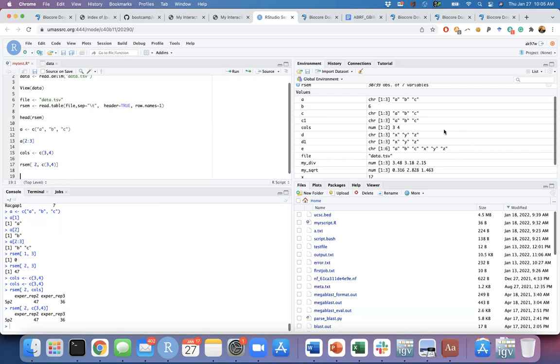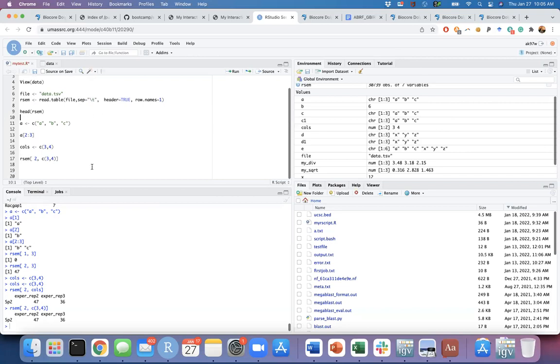It is the symbol for tab. Yeah. Okay. What does \t mean? It is an escape character. You remember when we were talking last week, in the last session, we were using it in grep, for example, or awk actually, we used this \t. It's a tab character to put the separation while you're creating your tables. And then when you open it, you need to use that tab \t here. Same thing. These are the same in many languages, like in Perl, like in R. In many languages, we use similar escape characters. In awk, it's the same.